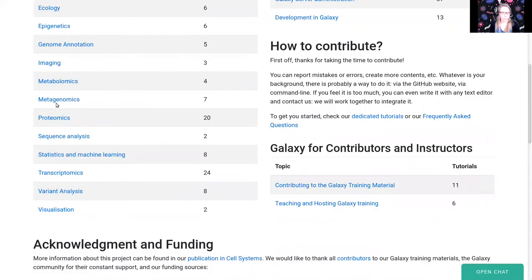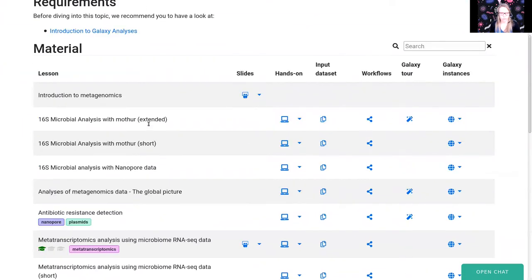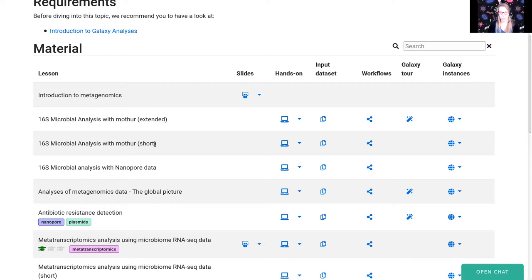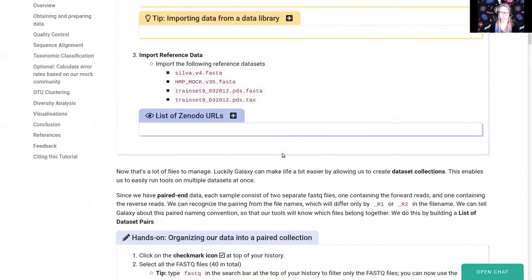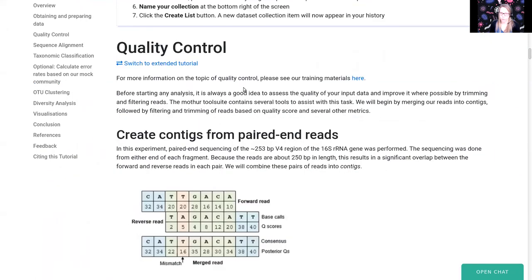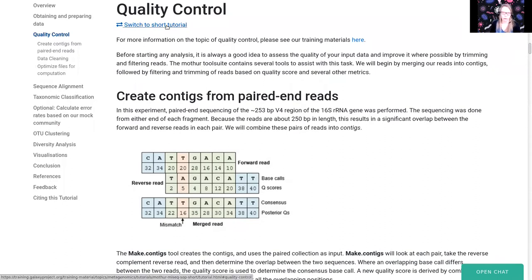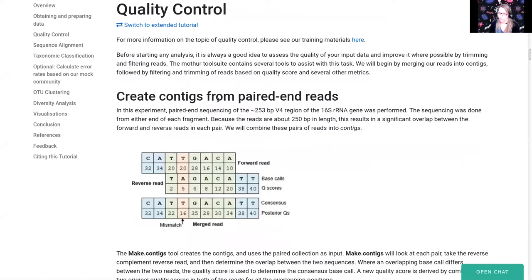This tutorial is in the metagenomics section of the GTN. There are two versions: the extended tutorial goes through every step manually with all the tools, while the short version consists of a series of workflows that run the exact same tools but is a little bit faster to click through, so you can focus more on the underlying concepts. Today we will do the short tutorial, but at the start of every section you can switch to the extended version if you want more information, or switch to the short one if you just want to run the workflow and examine the outputs.